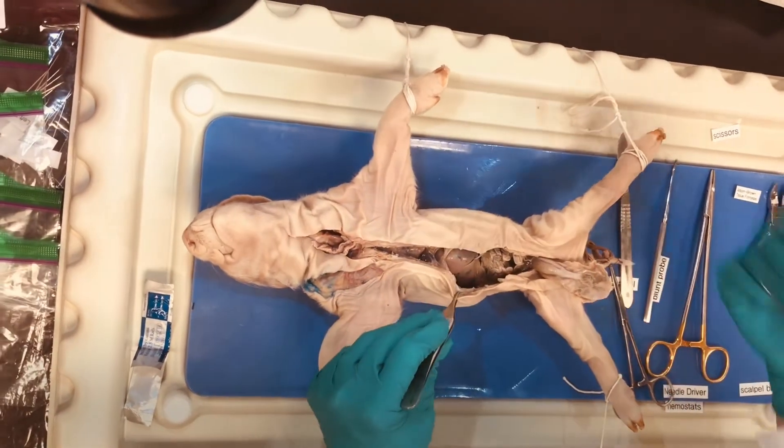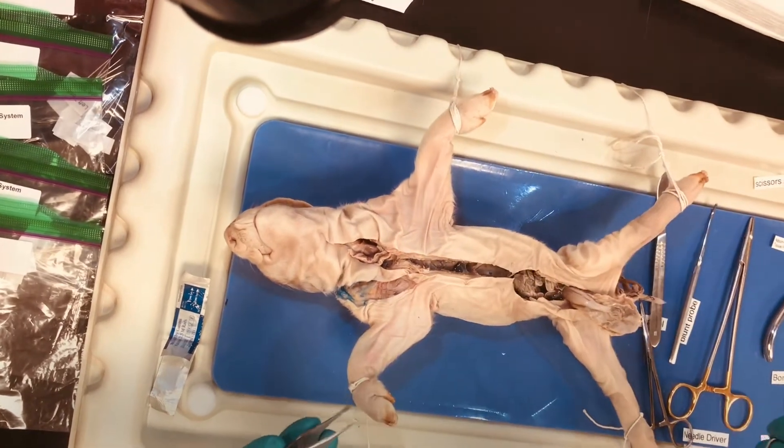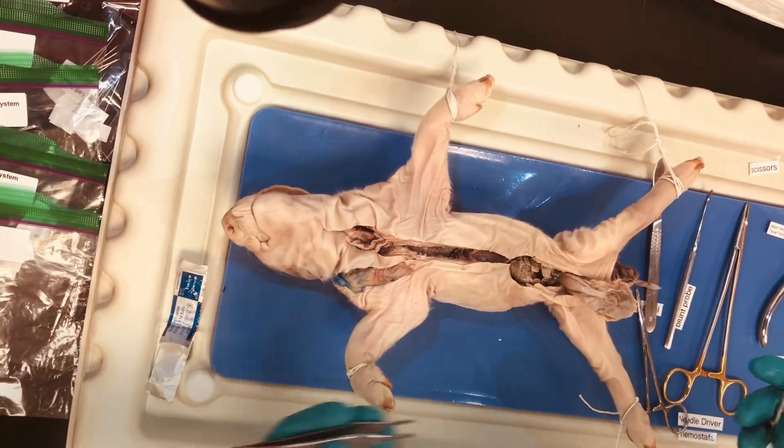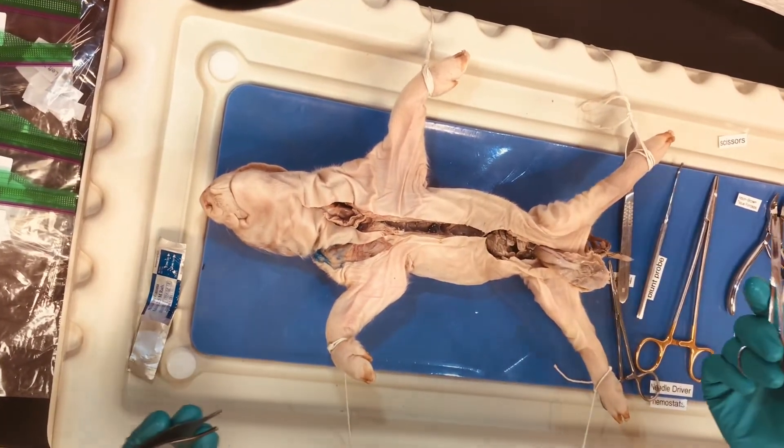Okay, getting our abdomen set up — this is how we're going to do this. I'm going to spend a couple of minutes, we'll fast forward, and then we'll go over some important tissues.